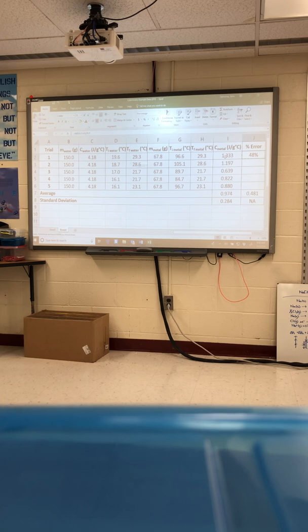Now, I can come down. Now, you might need to multiply by 100, but I already have something done in here. Look at what you can do. Rather than multiplying by 100 like we do, you could just go up here to the numbers and have it come out as a percent. Then you don't have to do the multiply by 100. Or you could put that in the formula, but it's kind of nice because it will give you the percent sign.